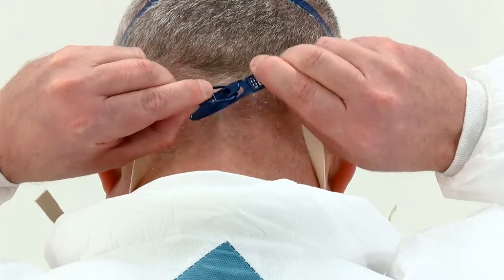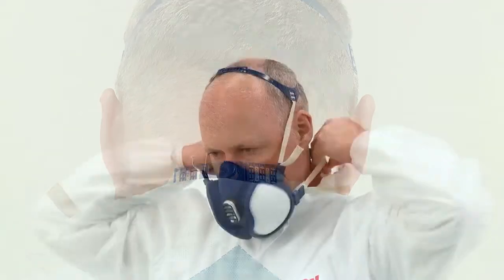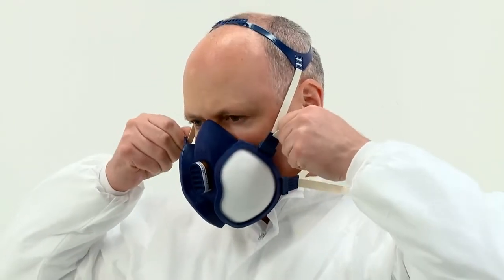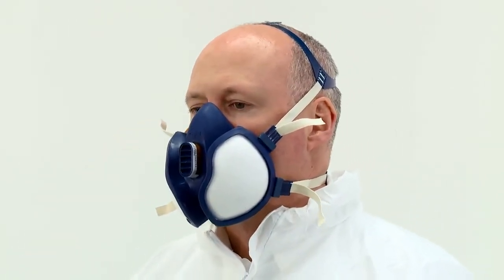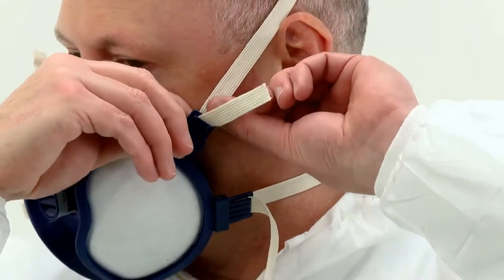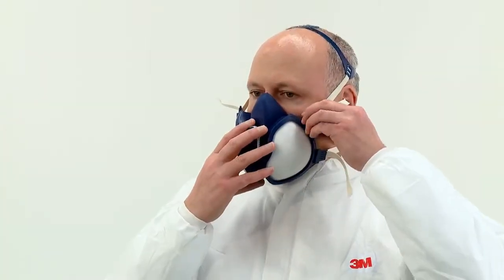Next, take a bottom strap in each hand and hook the straps together at the back of the neck. Ensure the straps have not become twisted. You can tighten the top head harness by pulling on the end of the straps to achieve a comfortable and secure fit. The bottom straps can be tightened in the same way. It should feel snug against your face, but take care not to over tighten. Strap tension can be decreased by pushing out on the back of the buckles. After tightening the head harness, slide the 4 plastic rings over the buckles to lock the head straps in place.